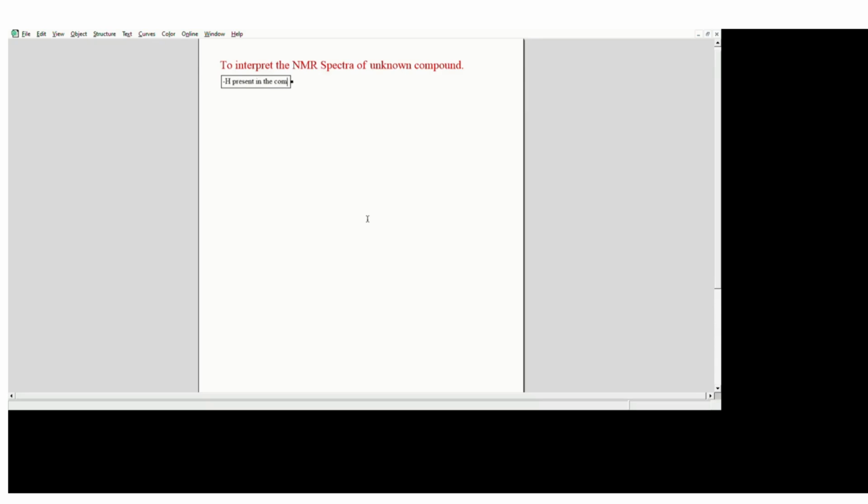We know organic compounds are a combination of hydrogen and carbon. If you know how many hydrogens and how many carbons are present in the given compound, we can elucidate the structure very easily. In structure elucidation, we discuss NMR in detail. Fine. So we start with the PCM.